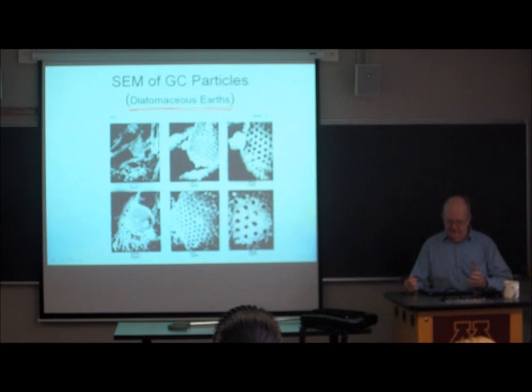and they happen to be very porous. They have a high surface area, and they're relatively easy to work with. And the GC community latched onto these in the early days, and they've never really been bettered. I mean, porous glass just doesn't do as well as diatomaceous earth.